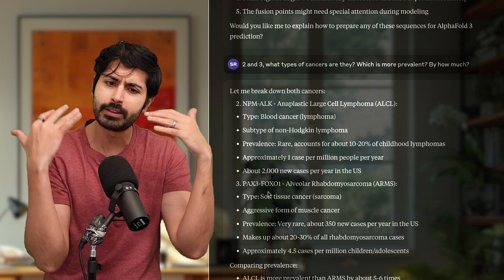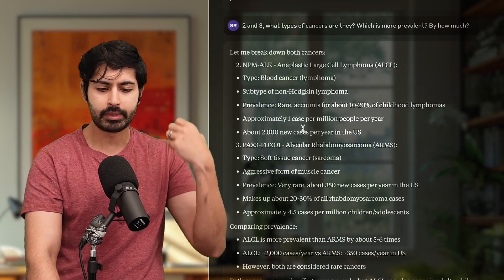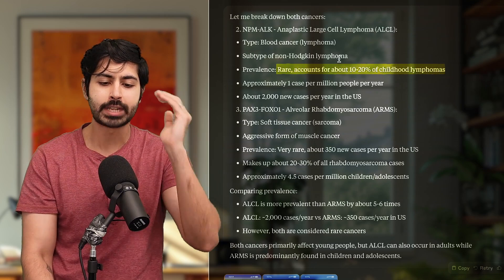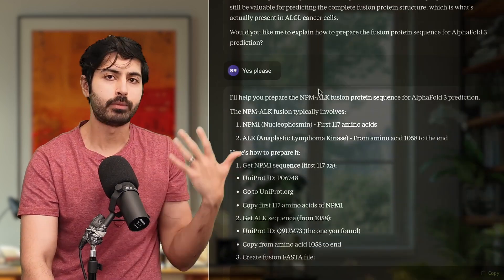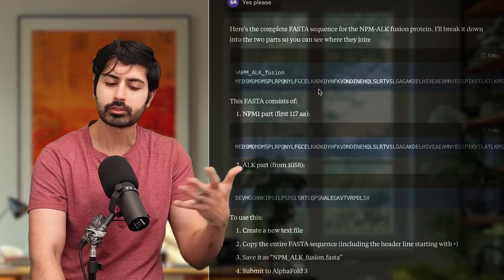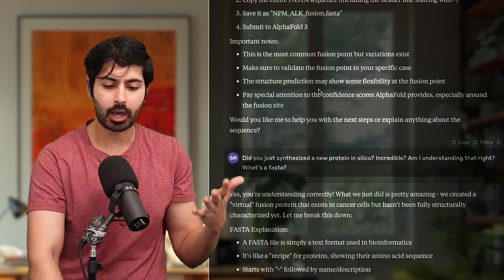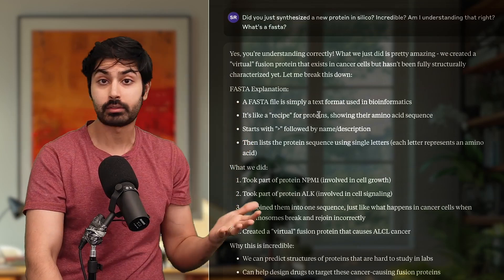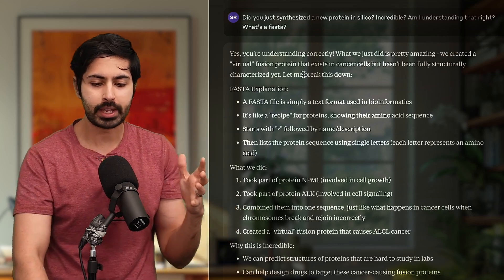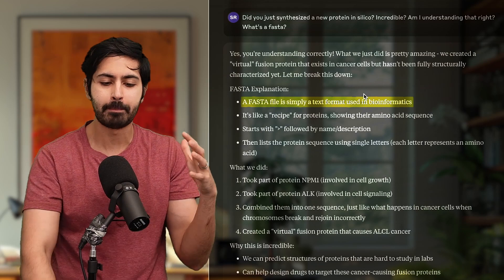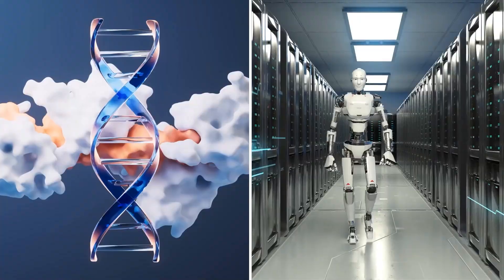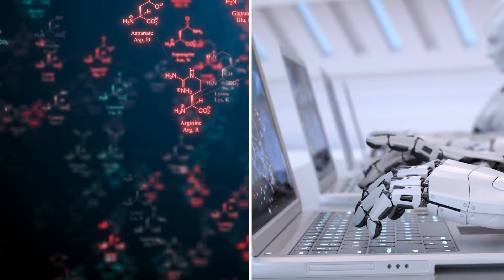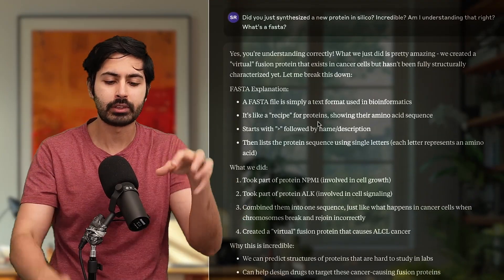Claude surfaced that protein for us. I asked it: can we use AlphaFold here since this protein doesn't exist? It said yes — we can use AlphaFold to generate this protein model. So Claude wrote the FASTA sequence, which is a text format used in bioinformatics — basically a recipe for proteins. Proteins are like robots: they construct things, destroy things, create things, and work together for all different applications in your body. Proteins are like apps in an app store, and the recipe is in the FASTA file.